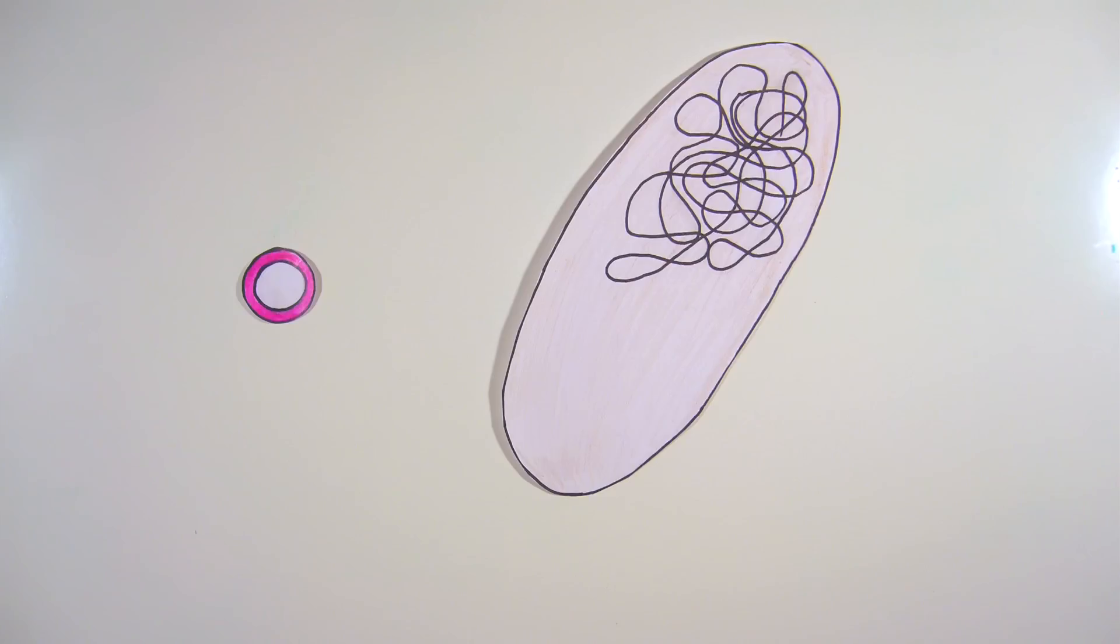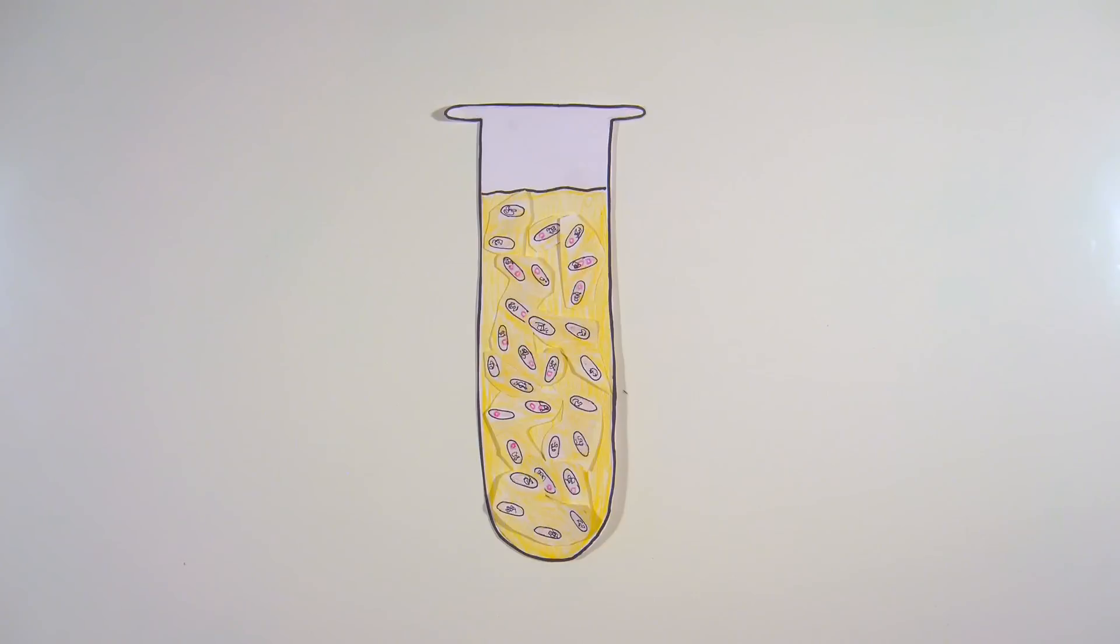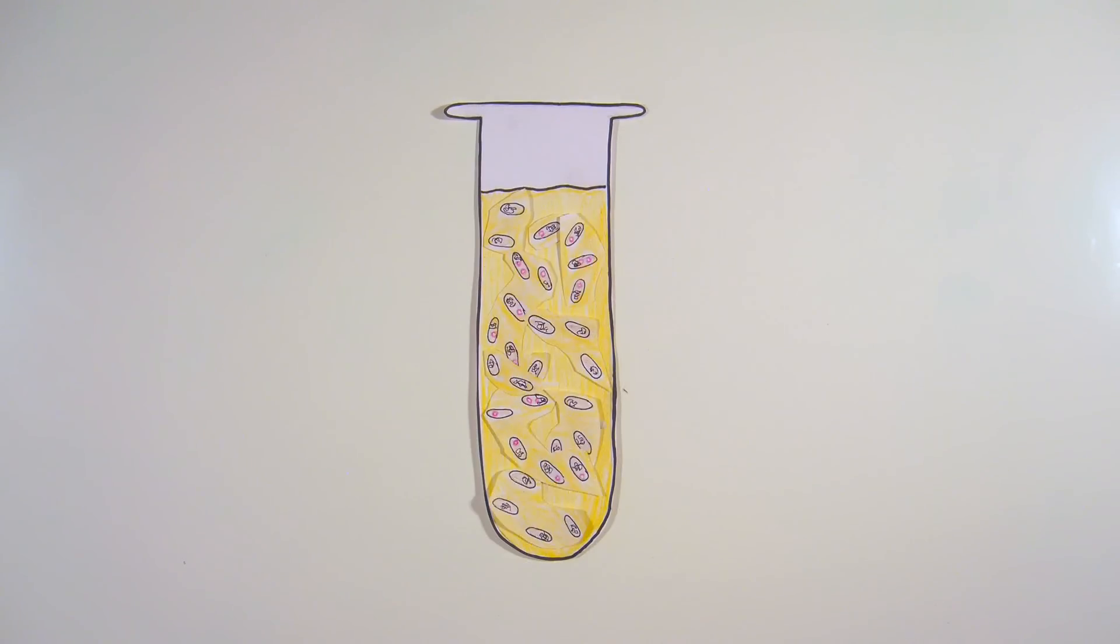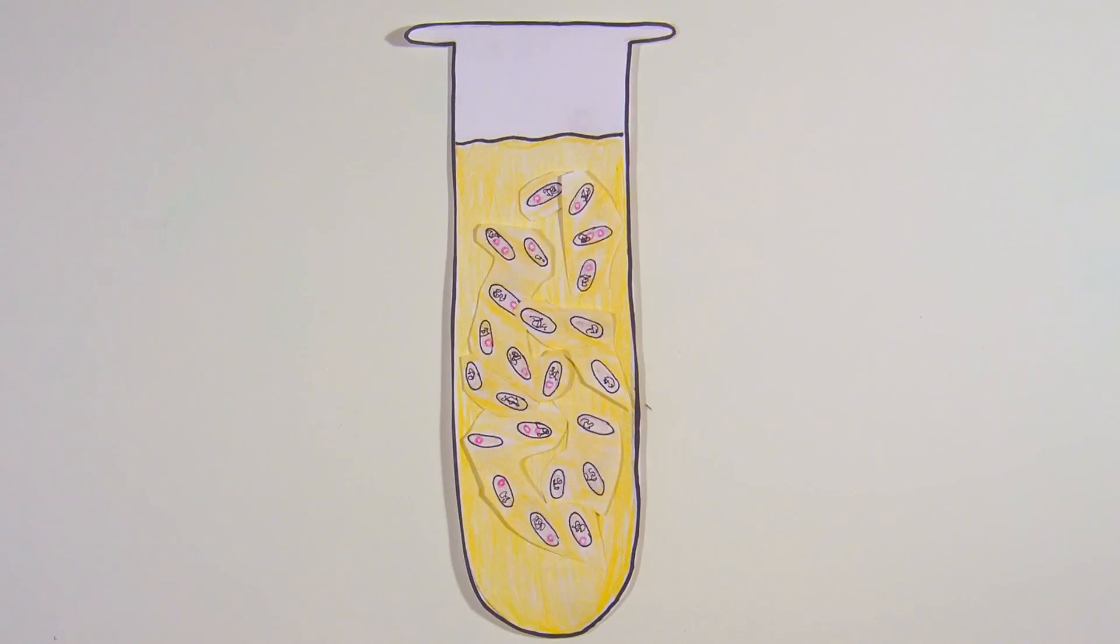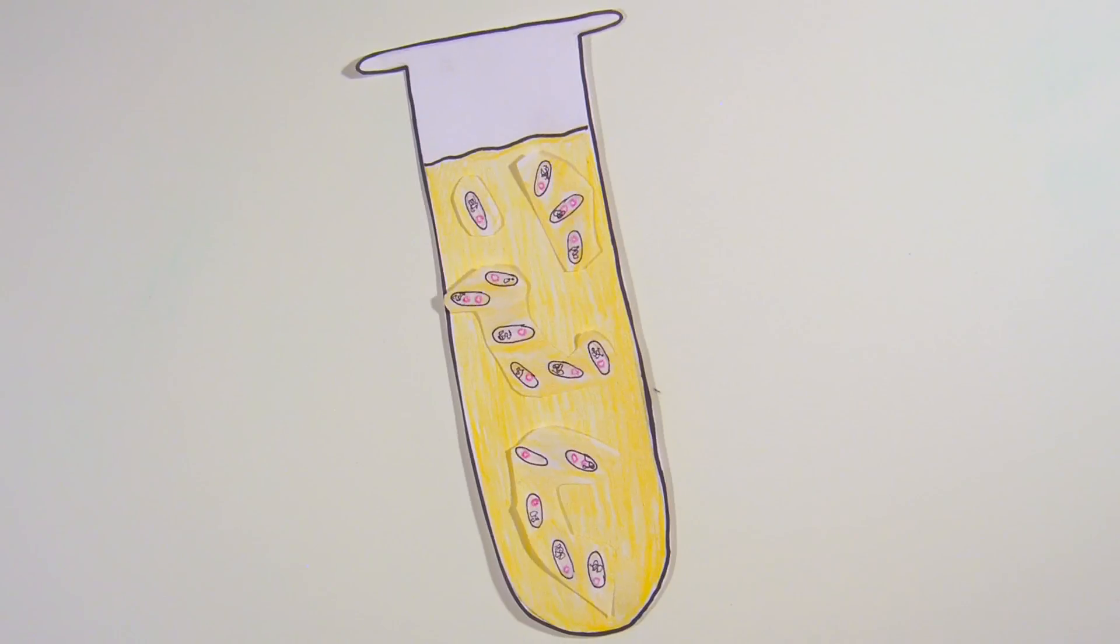Plasmids are introduced into bacteria through a process called transformation. Although bacterial transformation is far from 100% efficient, antibiotic selection for cells carrying the plasmid of interest is very efficient.